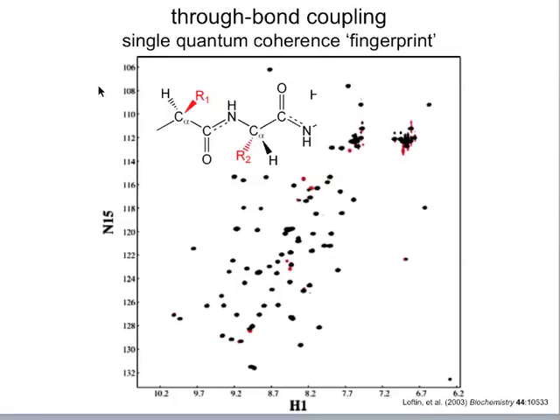We don't care about this so much. Just suffice it to say that we can create an NMR experiment in which we can look at the proton frequencies, but only those protons which are associated with nitrogens. And we remember which protons those are going to be. By and large, those are going to be the amide protons, right? Every amino acid in the chain is involved in a peptide bond, and every peptide bond has this proton-nitrogen pair.